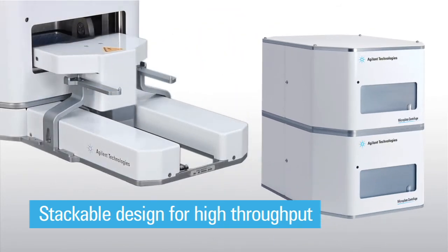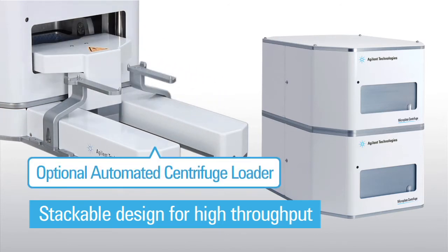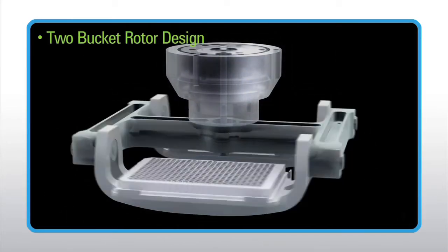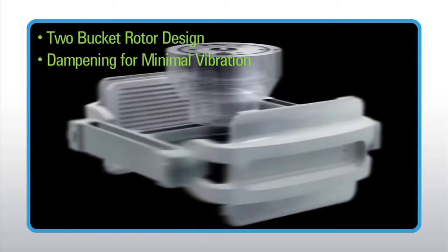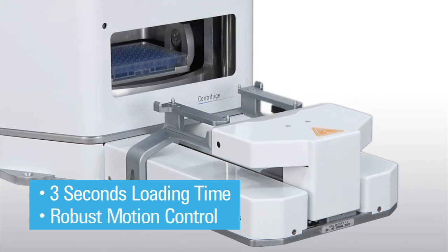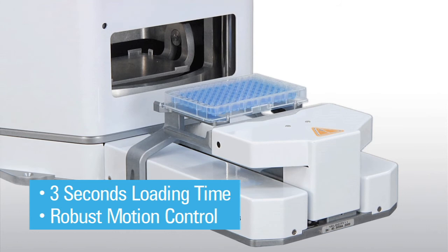For robots that cannot reach through the door, the optional automated centrifuge loader allows unobstructed accessibility. The centrifuge features a two-bucket rotor design. Dampening isolates vibration from the mounting surface, minimizing its impact on adjacent instruments. With the loader's three-second loading time and robust motion control, the microplate centrifuge can be accessed by most laboratory microplate handlers or robots.